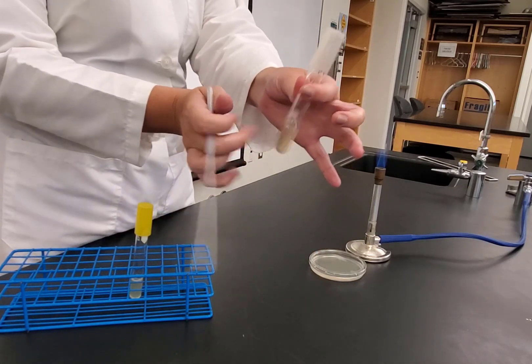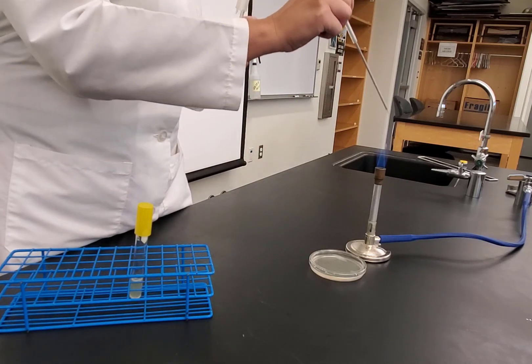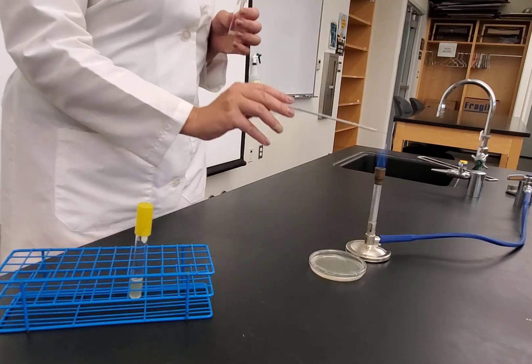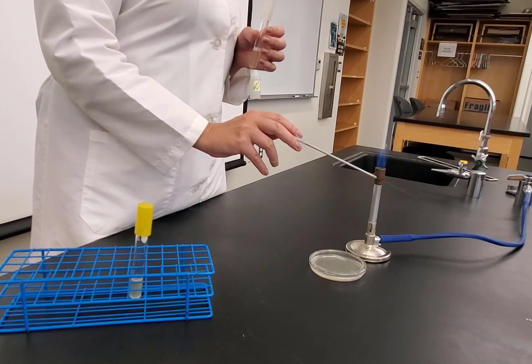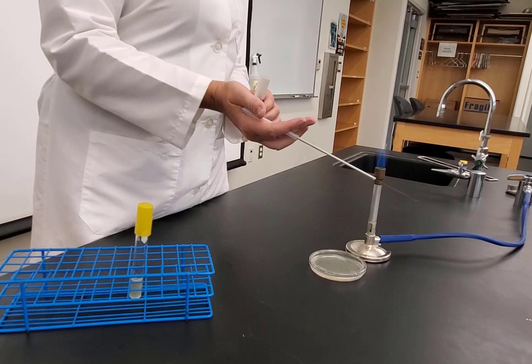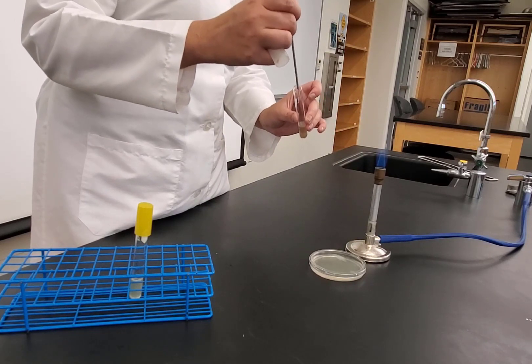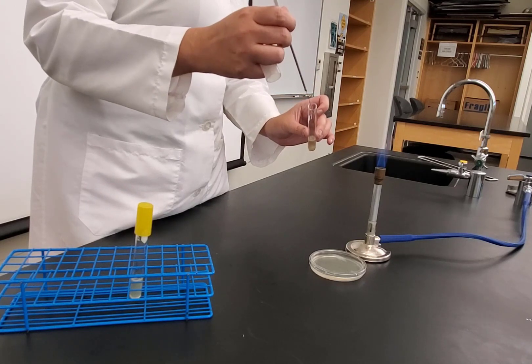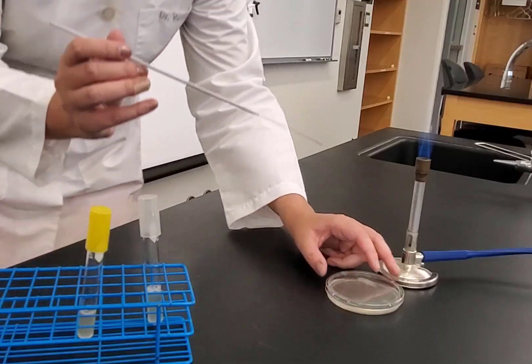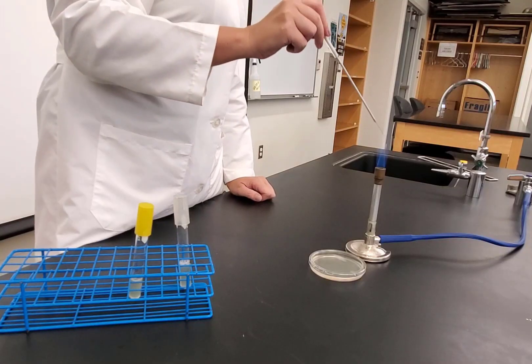Starting with B. subtilis first — vortex to mix, take the cap between palm and ring finger, flame the loop and let it cool. Cap between pinky and ring finger, flame it, go in, pick up some bacteria, come back out. I have liquid culture on my loop — keep that loop hand as steady as possible. On the side labeled BS, do one broad streak, then flame sterilize.